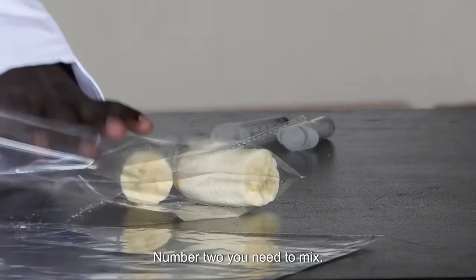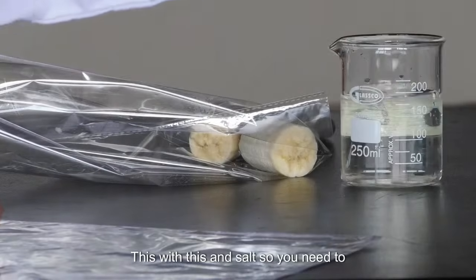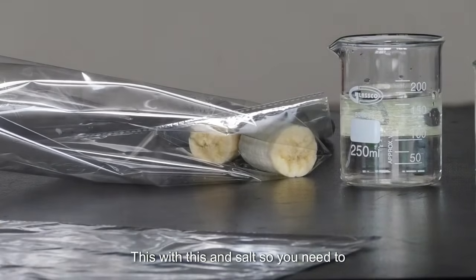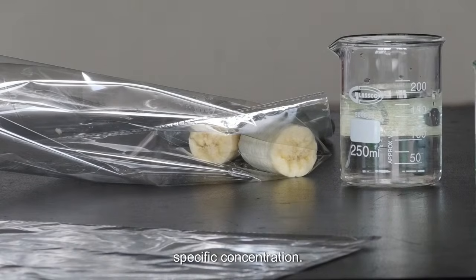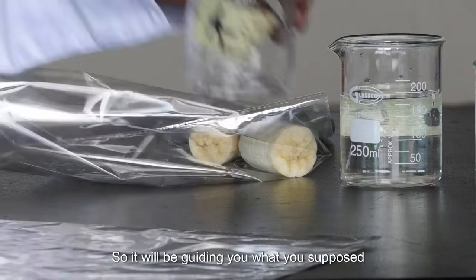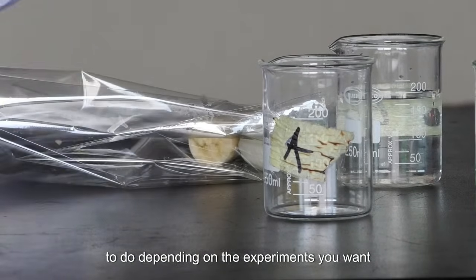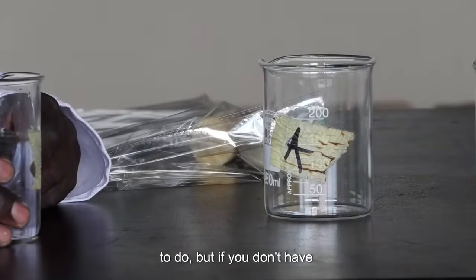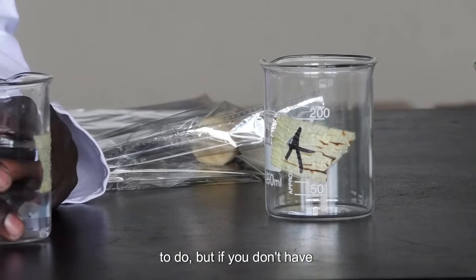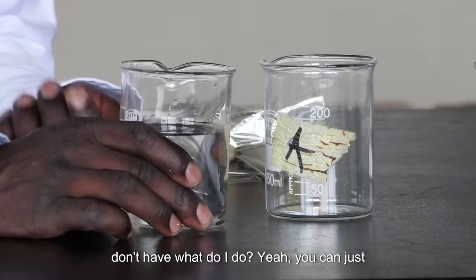Number two, you need to mix this with this and salt. So you need to measure. You have to be able to measure a specific concentration, so it will guide you on what you're supposed to do depending on the experiment you want to do. But if you don't have the equipment, how do you measure it? If I don't have it, what do I do?